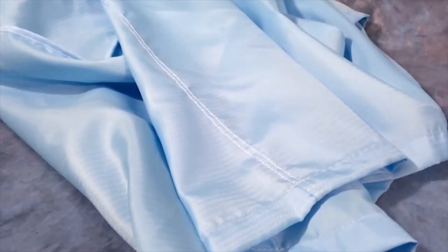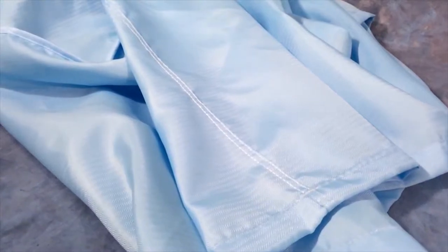To make the covers, we start with an overcast edge which will help to eliminate fraying, and then it's a double needle stitched seam that we use on all of the seams. I'll be honest with you, I have no idea what that stuff means, but apparently if you're into sewing, you know that means these covers are made really well.